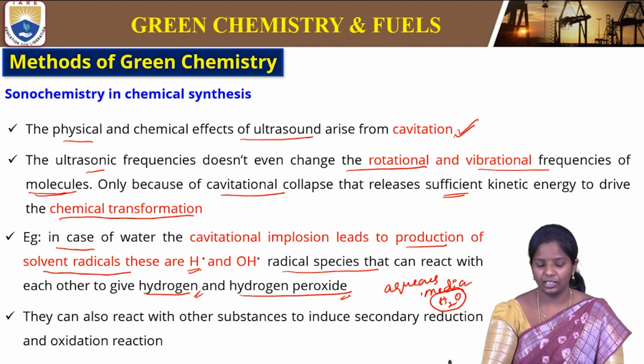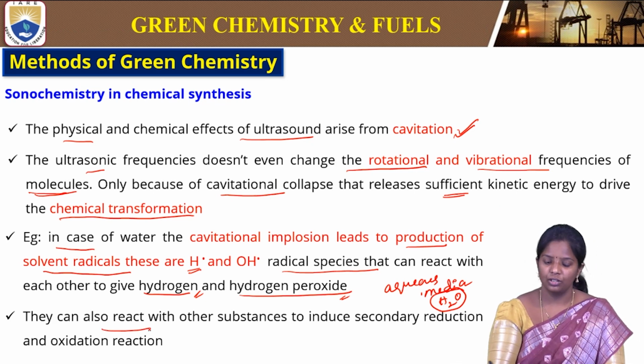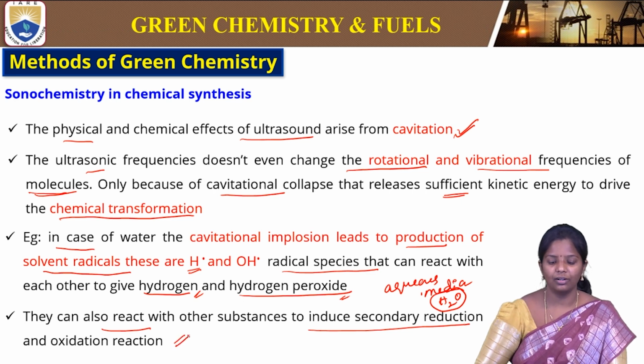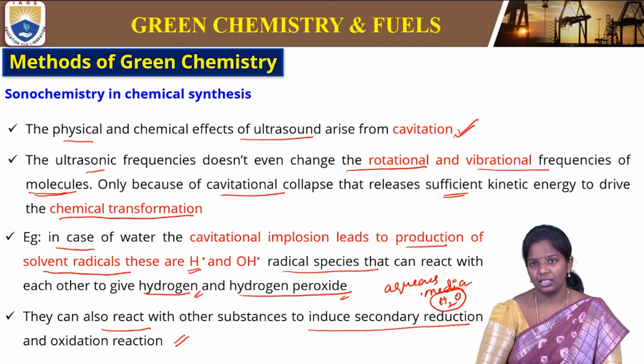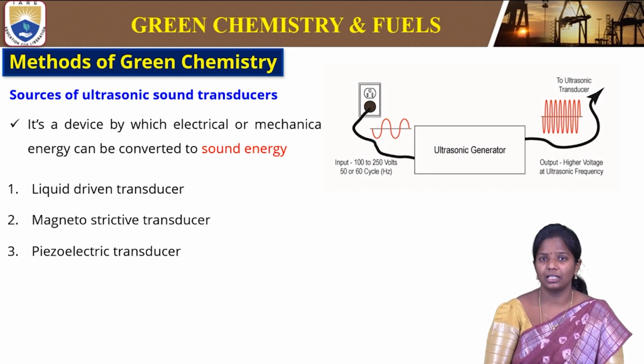They are reactive and can also react with other substances to induce secondary reduction and oxidation reactions. So all this mechanism, or the synthesis, takes place just because of ultrasound waves.